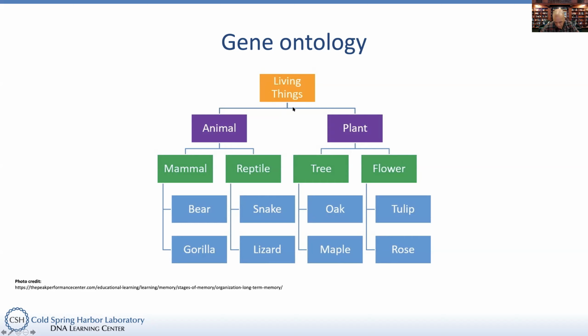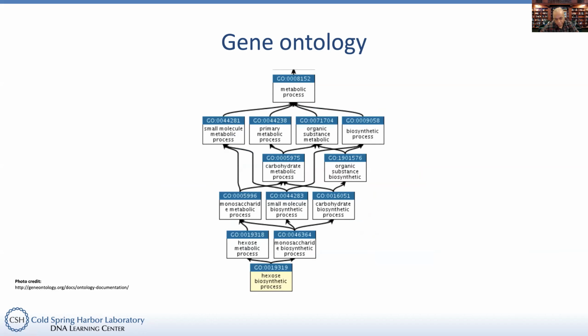So researchers have developed a really nice way of taking everything that we know about every single gene and then putting it into a gene ontology. And sometimes you'll hear the phrase GO-term, G-O. And each one of these processes, like metabolic process, is extremely general. But then maybe it's something that's biosynthetic or organic molecule, and so on and so forth. And you can trace these ontologies and these relationships so that if you know that a particular gene has one of these activities, you could also see other activities it may be associated with.